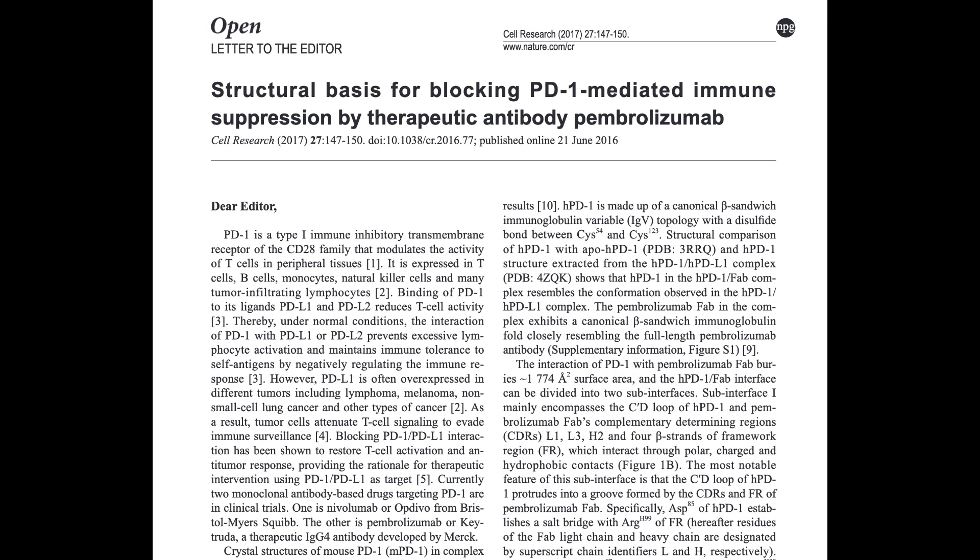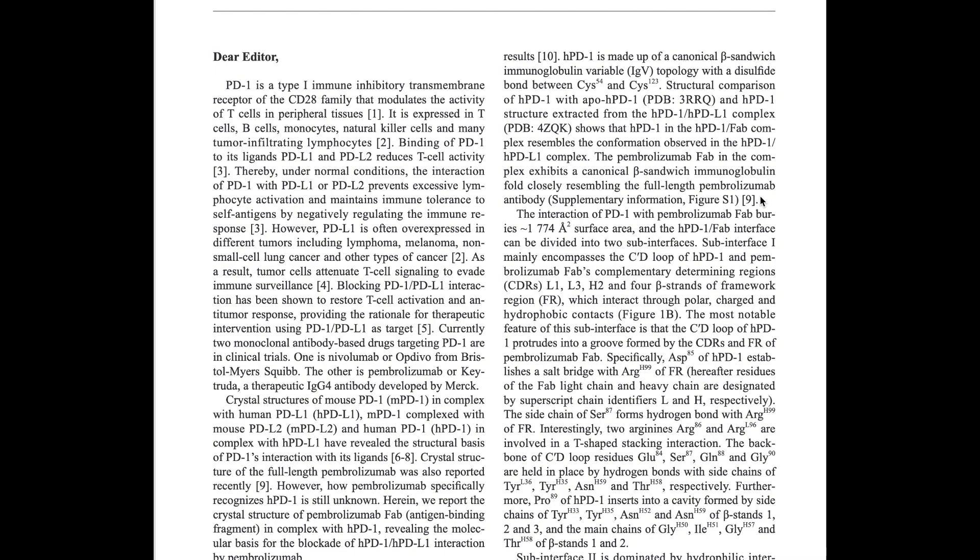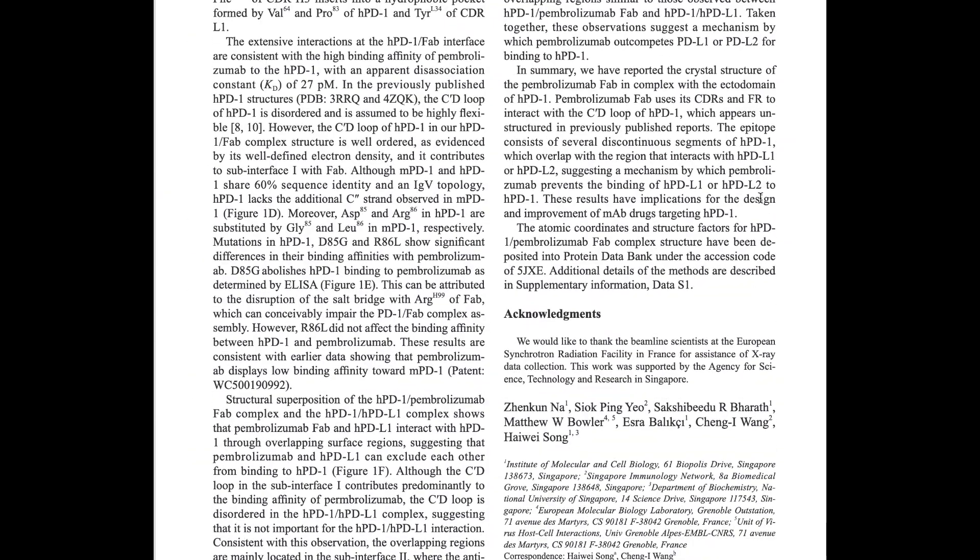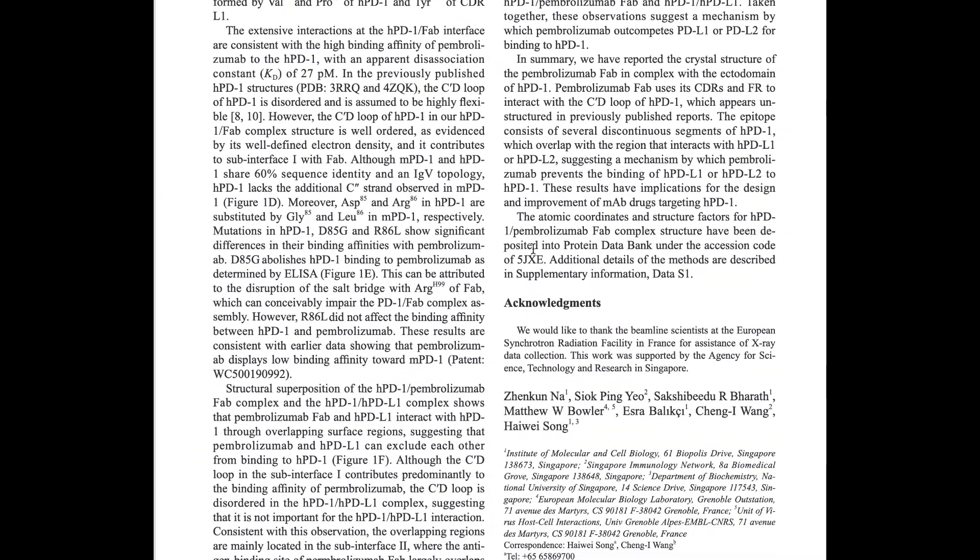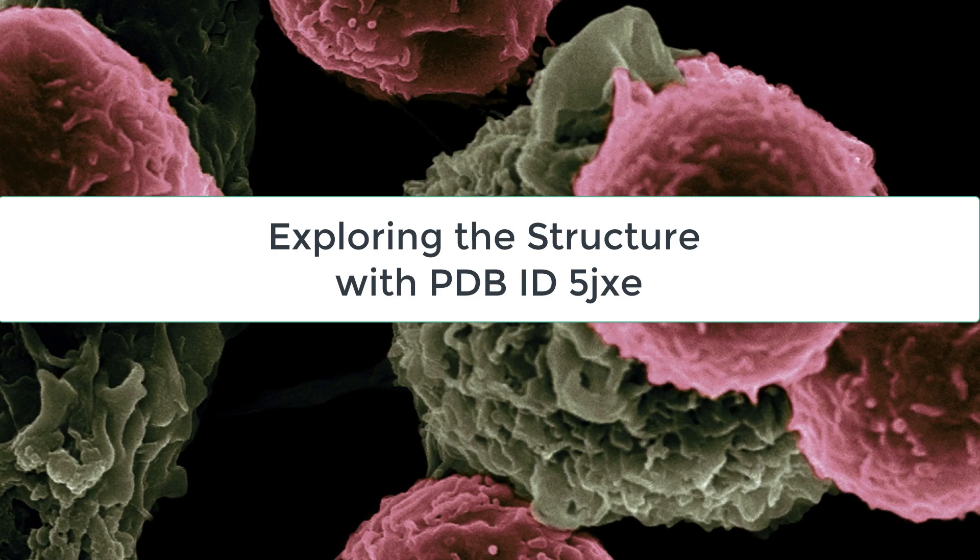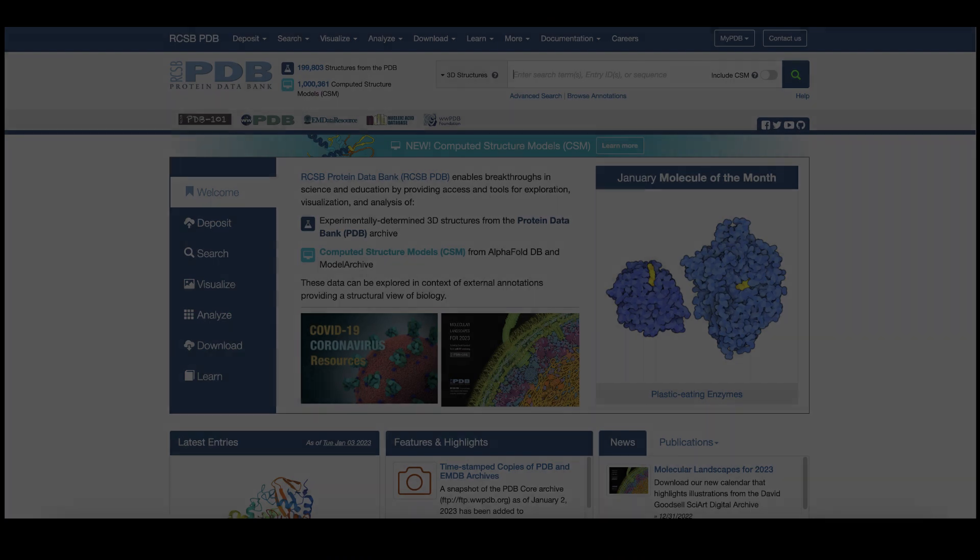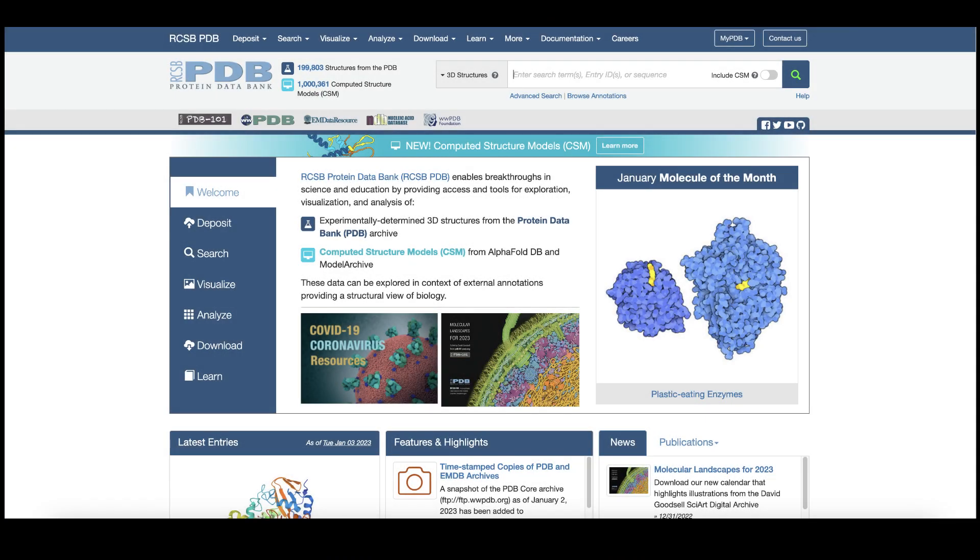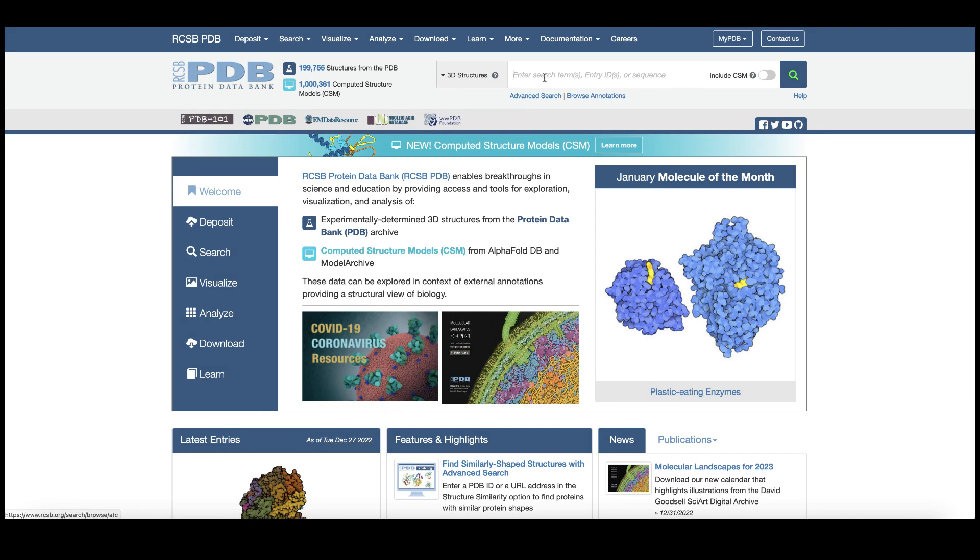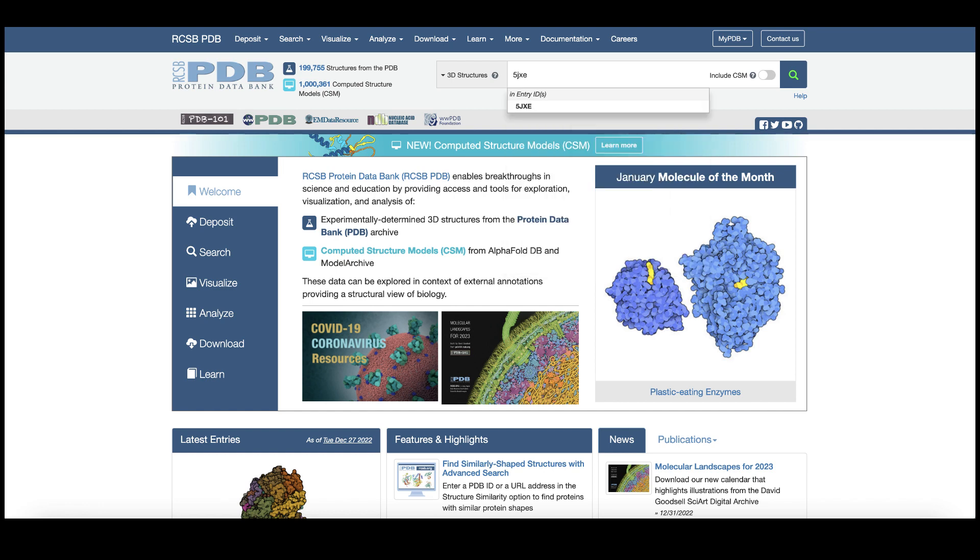Say you were reading a scientific article about pembrolizumab, an anti-PD-1 antibody approved by the U.S. FDA for treating various cancers, and you note the PDB identifier 5JXE for the structure of the human PD-1 pembrolizumab Fab complex. Begin exploring this structure by going to rcsb.org and entering PDB identifier or PDB ID 5JXE into the top search box and clicking on the search icon.